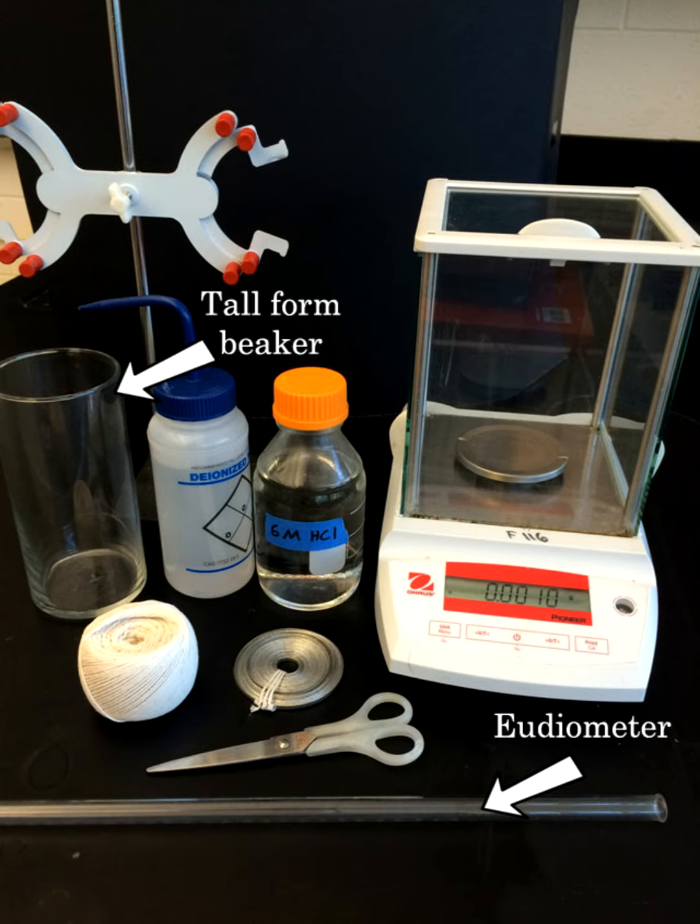This tall form beaker will be necessary in order to have water levels that are high enough to reach the values on the eudiometer, and the analytic balance is used to determine high precision values for the mass of the magnesium.